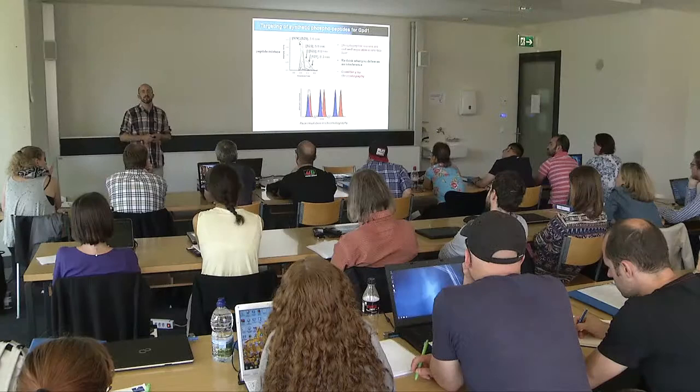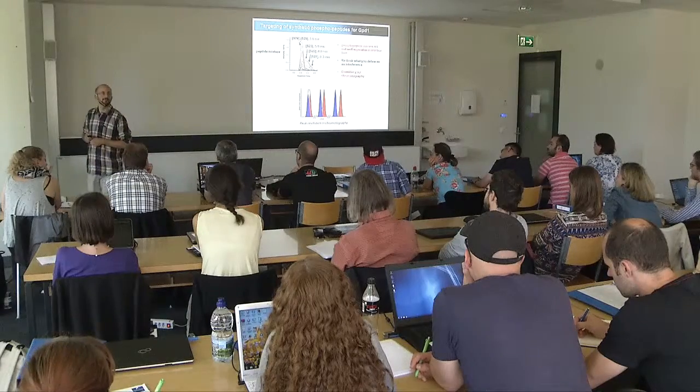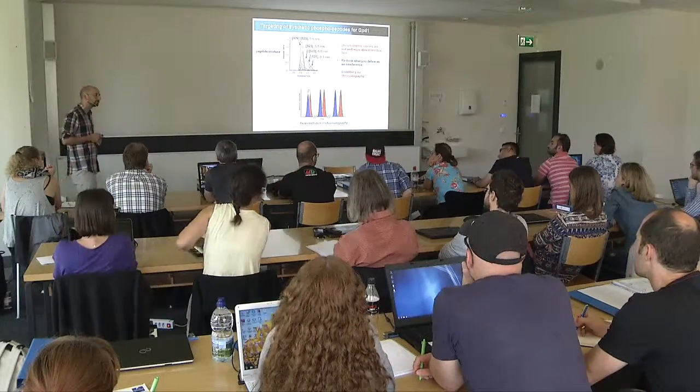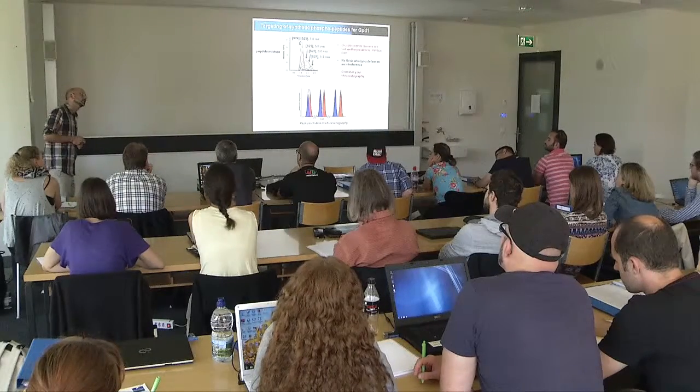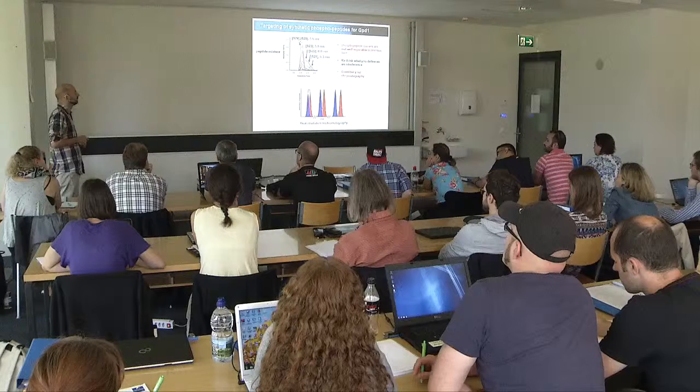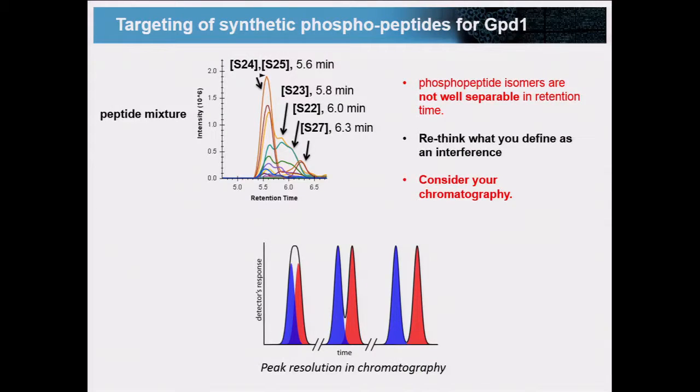These were giving measurements. We ran out of sample. Look at the height inside of it. The height of what? Look at the height. In this case, we cannot exactly look at the height of the peaks because they are synthetic peptides that come from different things, and we don't have a reason to assume that they would have the same. We have no tools to assume that they would have the same heights.